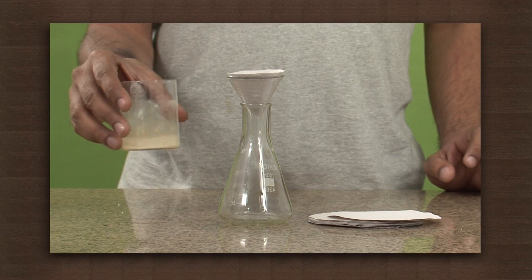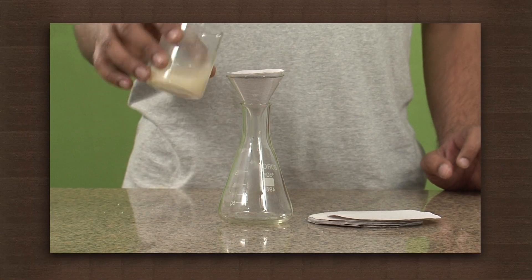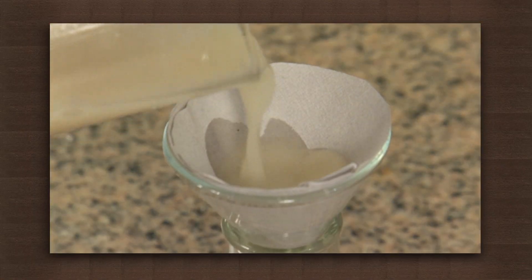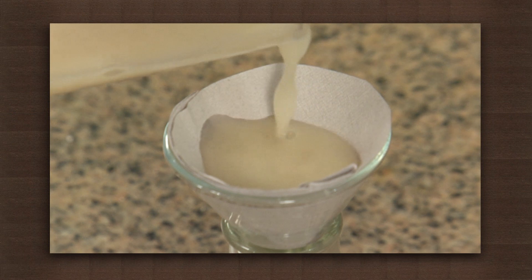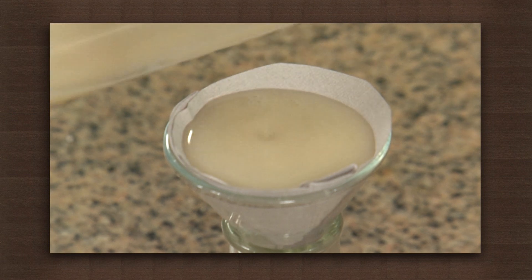Pour the mixture of wheat flour and water on the filter paper. Wait and observe.